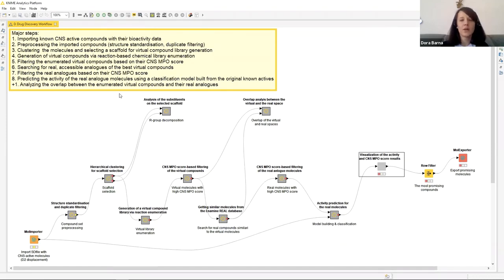And now we can continue with trying and playing with the workflow, where all of you can start running the nodes and see the results. We will give you, let's say, 12 minutes, and we can continue at 15 minutes past 6 p.m. And during this time, we can also answer some of the questions that appeared in the Q&A box.